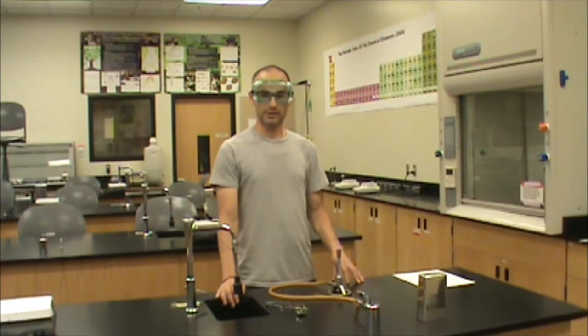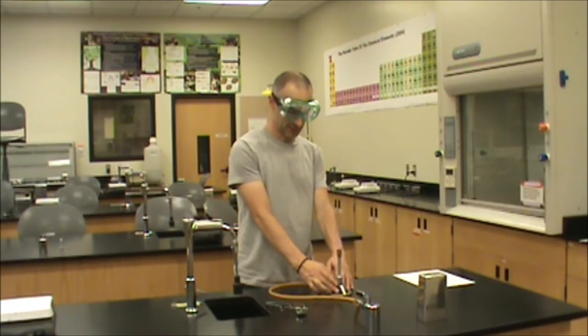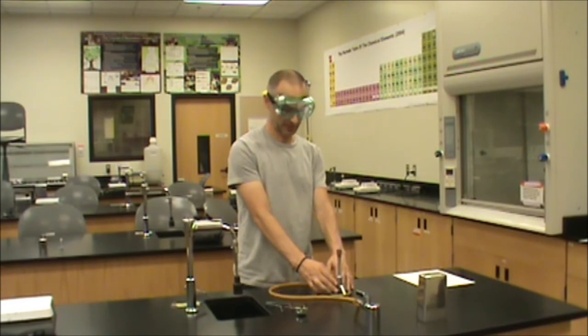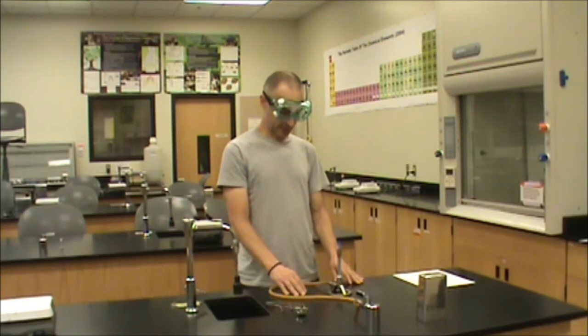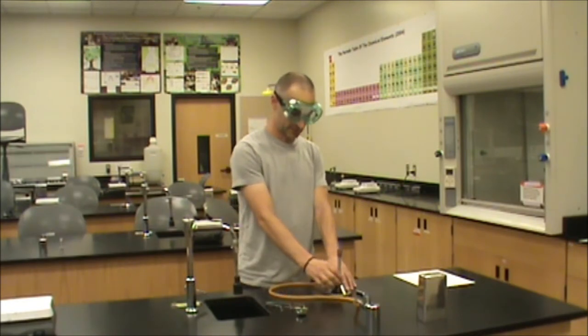You may need to adjust the flame size or the amount of air going to the flame. The flame size can be adjusted up or down using the valve at the base of the Bunsen burner, and you can adjust the air right here.